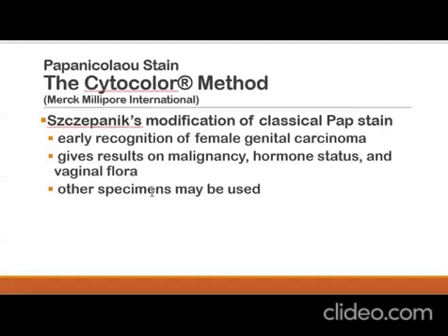Also, same with your classical Pap smear staining, other specimens could also be used in this modification, such as specimens from tumors, from punctates, from excised specimens, from the sediments or the centrifugates from body fluids. Okay, so that's it.